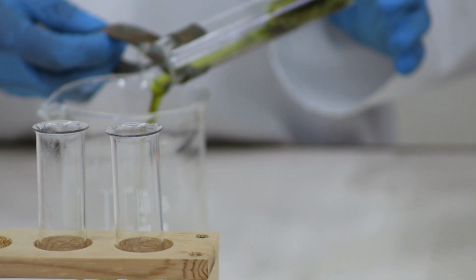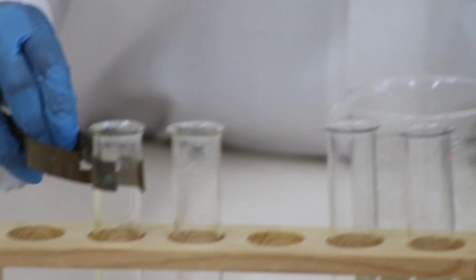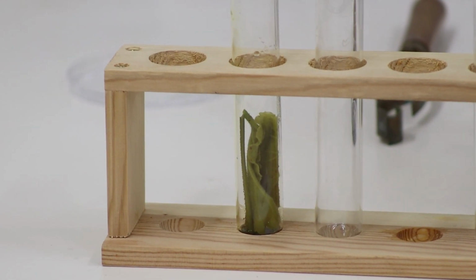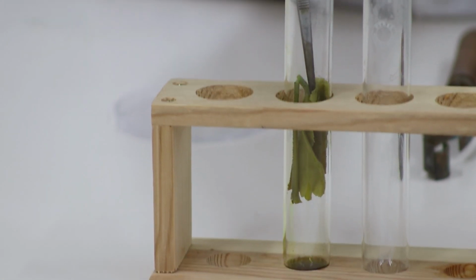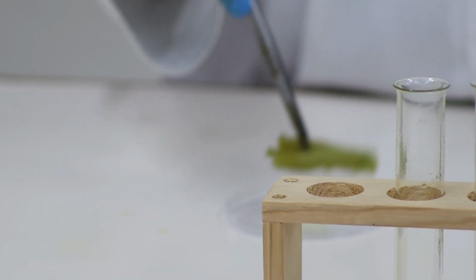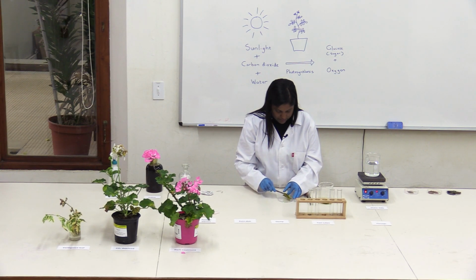So what I'm going to do now is to just decant the ethanol, and then I'm going to place the leaf on a petri dish. Remember, the ethanol has slightly dehydrated the leaf, so you need to very carefully open up the leaf again. The leaf is now a bit brittle, so you must be careful when unraveling the leaf.